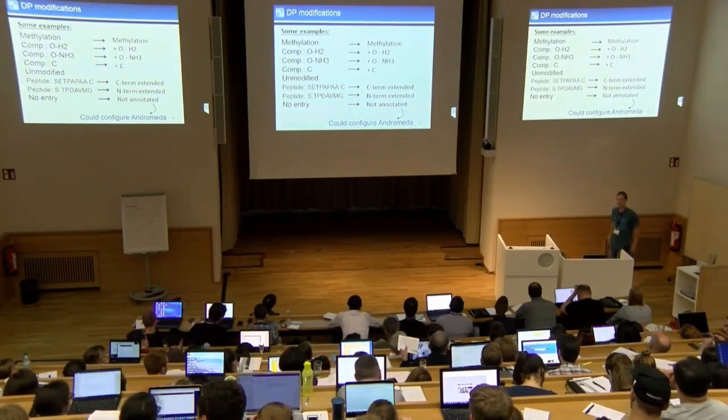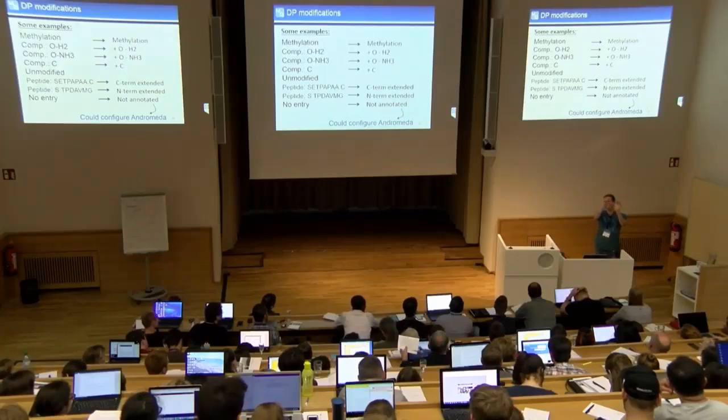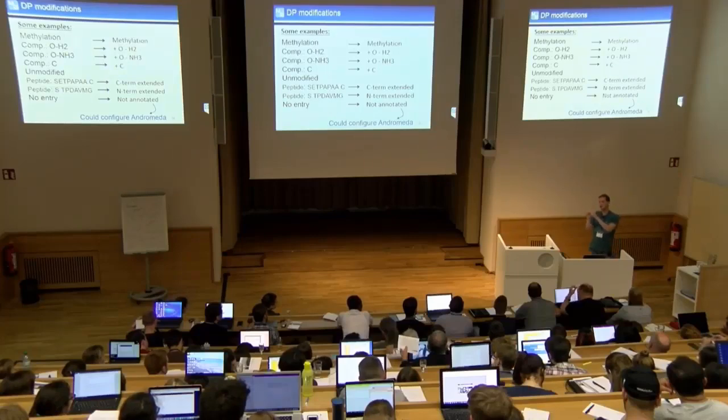Okay, so I tried to show this in the example where I had the base peptide and I put a modification on every amino acid. And so what's done internally is, this is more of a thought experiment.